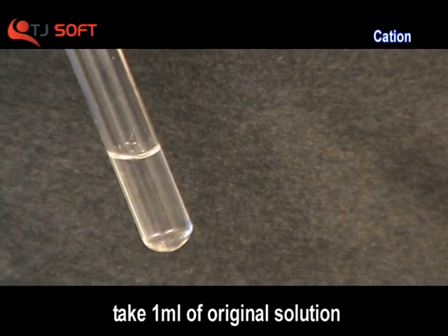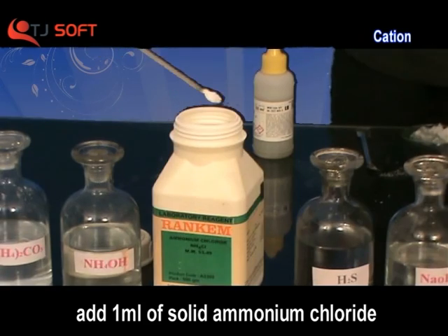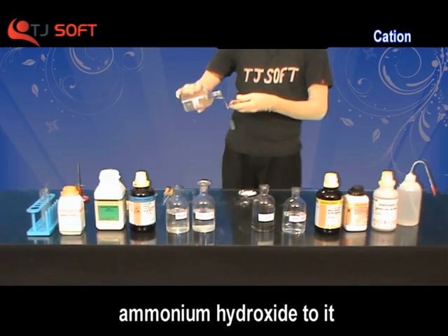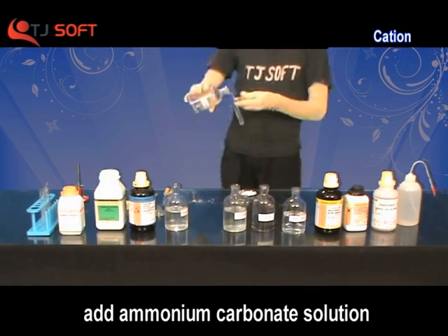Now take 1 ml of original solution in a test tube. Add 1 ml of solid ammonium chloride to it. Add a small amount of ammonium hydroxide solution to it, and then add ammonium carbonate solution to the solution.